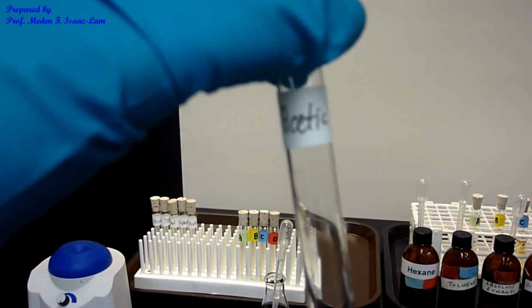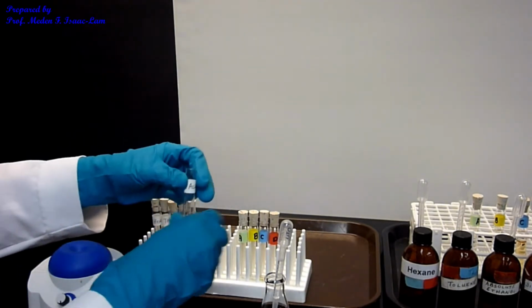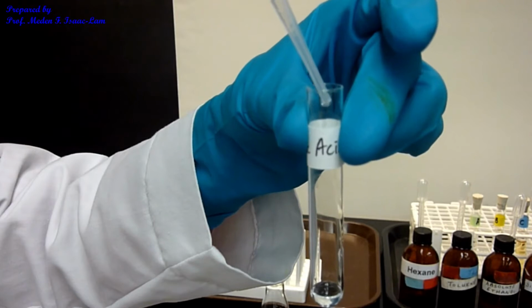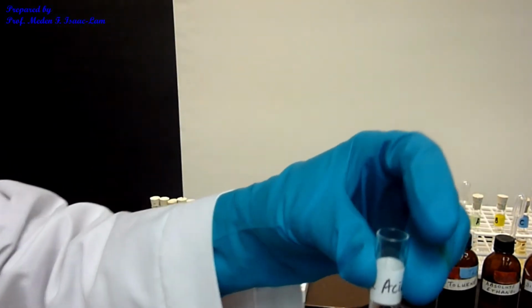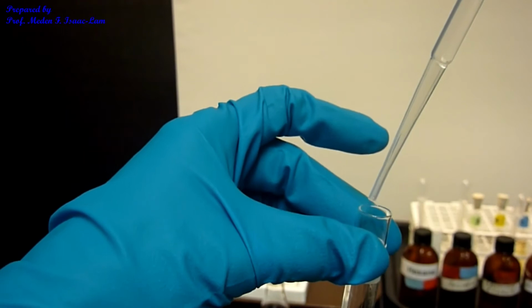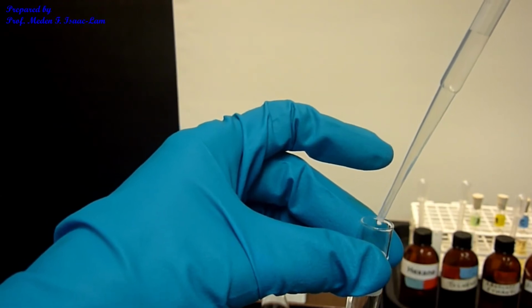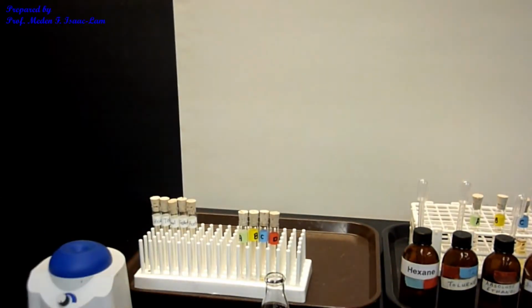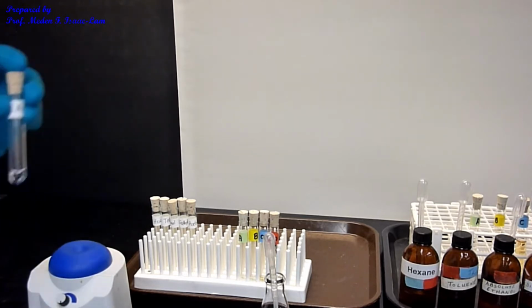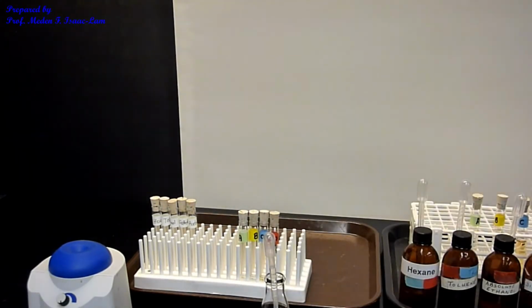Last sample is acetic acid. Again, 10 drops of water. I'm going to vortex a little bit, and then this is now the sample. All right, let's go over them again.